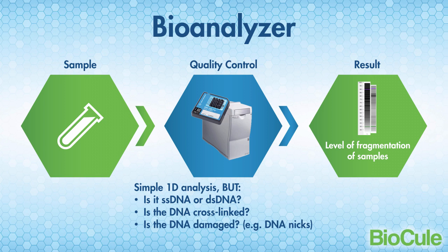Many labs also use a bioanalyzer after the NanoDrop to QC the sample. However, the bioanalyzer only offers a one-dimensional view of the sample, and therefore can only report on the level of fragmentation. But fragmentation is only one way that DNA can be damaged. Nothing is reported on the amount of single-stranded versus double-stranded DNA, the level of cross-linking, or any other type of damage, such as DNA nicks. Despite being the gold standard for sample QC, the bioanalyzer has a lot of shortcomings and is ripe for improvement and replacement.